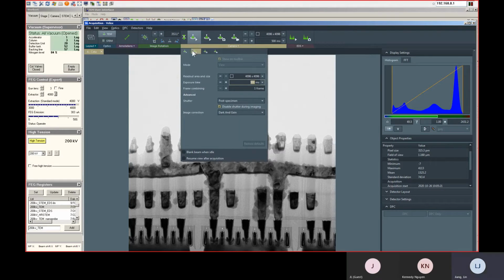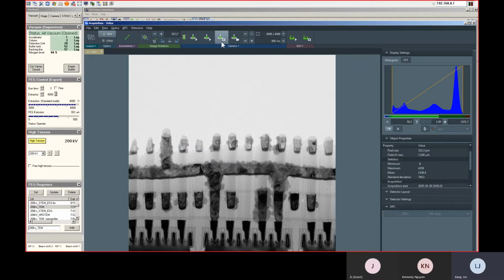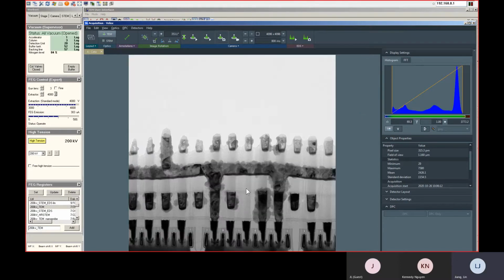So that means if you do, we just go here. We can just take imaging. We can do acquire. We set up the acquisition time. That means the max count is gonna go 8000, so we don't want to go beyond. Okay, probably 0.8 seconds is safe. We can just acquire image. So now we get the max count is almost 8000, but not beyond 8000.